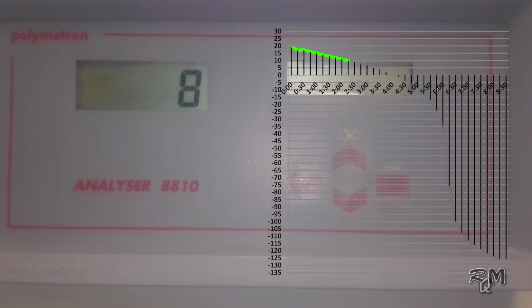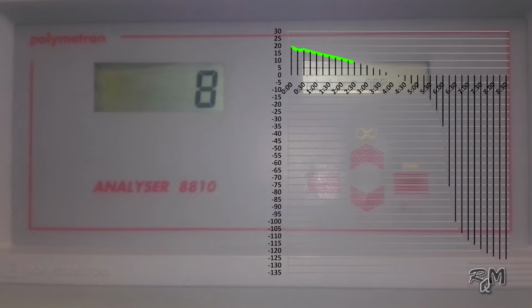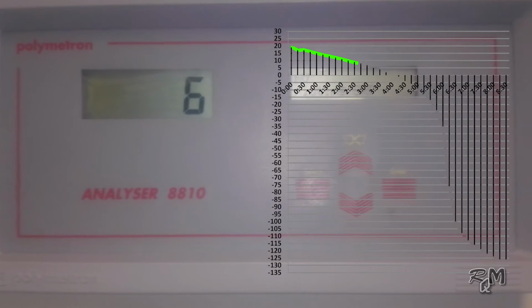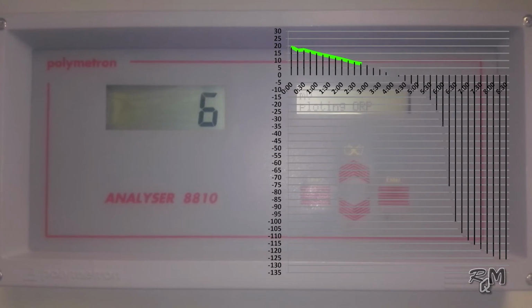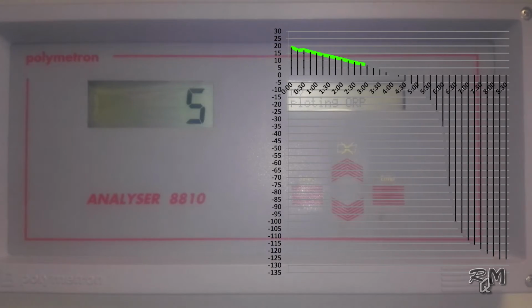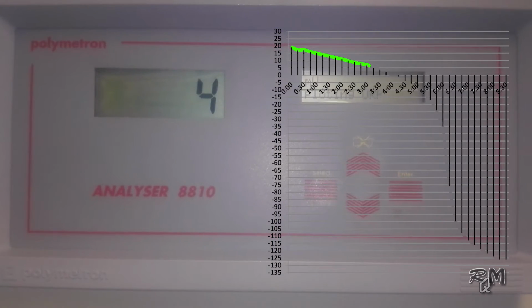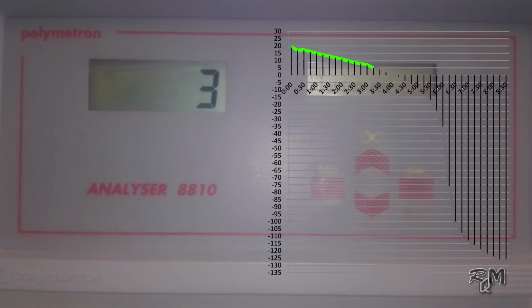Sometimes this millivolt reading is erratic. It may happen due to the following problems. Number 1, maybe your conditioner reagent is not correctly prepared, which you can verify by the pH value of the sample after injection of conditioner. It should be 8.3 plus or minus 0.2 pH. Number 2, maybe your conditioner pump is unable to inject sufficient conditioner due to aging of the pump's tube. Number 3, maybe the electrolyte of the ion selective electrode needs to be refilled. Number 4, maybe any one or both electrodes need replacement.